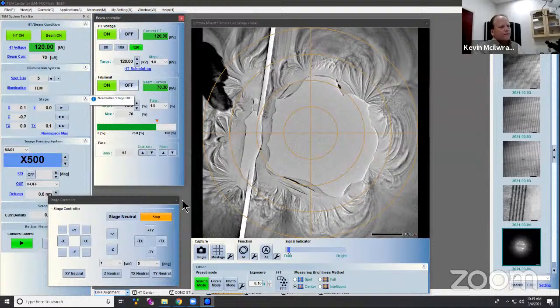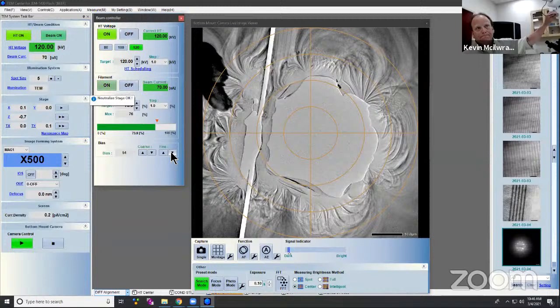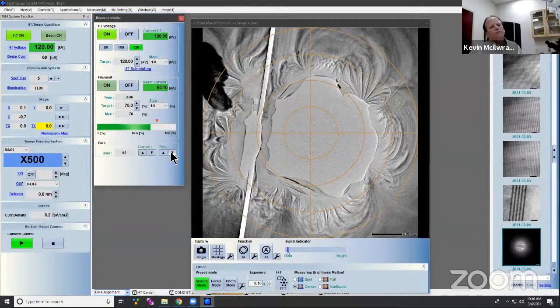So, Kevin, yeah, there is an interesting question. It says, why when the sample is irradiated by X-ray, I already explained that it is not irradiated by X-ray, it's irradiated by electrons. Yeah. But why does the sample look illuminated in some parts? Can you explain the contrast on the TEM image?